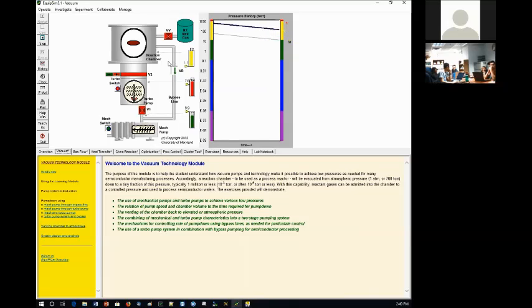Because this was vented, the large chamber was vented. Now it's taking much longer. You guys observe? Why is it taking much longer? Because now the volume has changed drastically, right? This reaction chamber is much bigger. So it's taking a lot longer than it took before just to pump down this little bypass line.